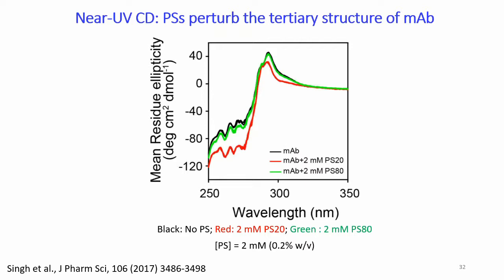Thank you very much. Another viewer writes in, did you verify changes in the secondary structural contents in the presence of PS80 and PS20 to support the Raman data?